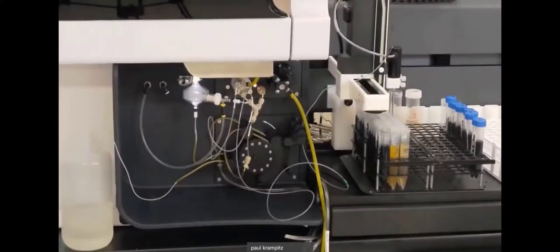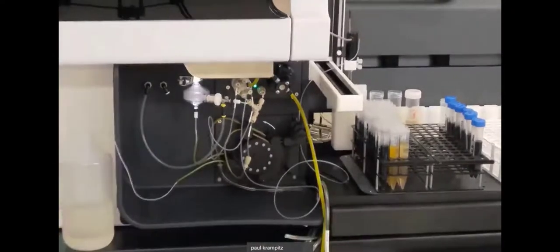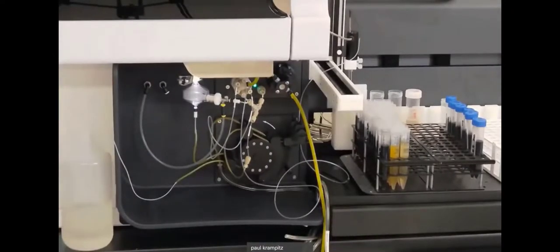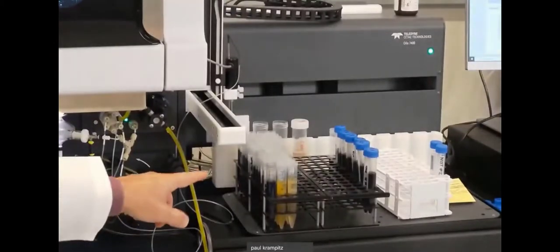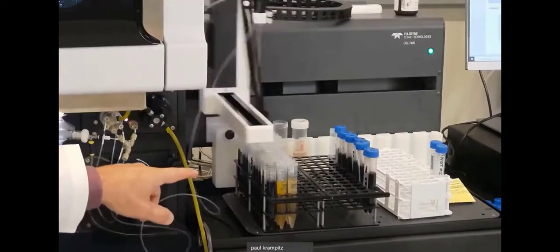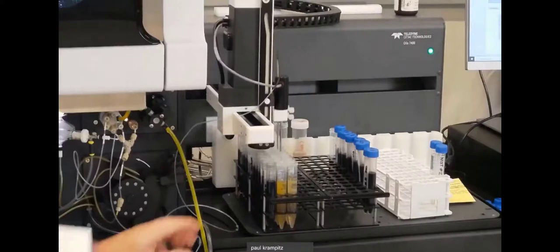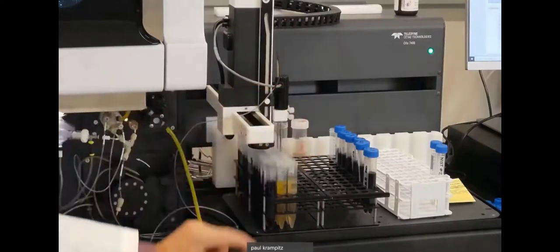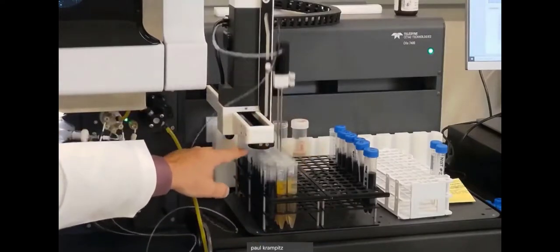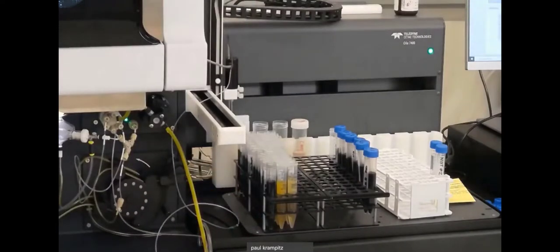I am actually doing what's called a screening right now of all these oils that you see over here. And let me see if I can get fancy here and zoom in a little bit more. So this autosampler right here is a CTAC 7400 autosampler. I don't know if you can see it. Yeah, I think you can see it. So there's a drip tray down here, and there's also a stir assembly on the front. This drip tray, you'll see it flip in when it's moving so you don't flick little droplets of oil all over the place or cross-contaminate your samples as it's coming across it.